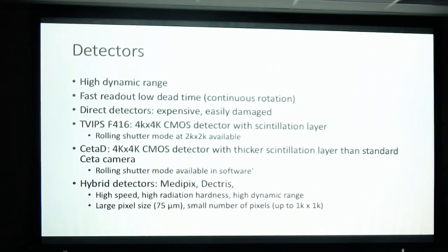The companies that make these generally had been making detectors for X-ray for synchrotrons, but now they see where the market is heading, so they're making detectors for electron microscopes now, for these diffraction experiments.